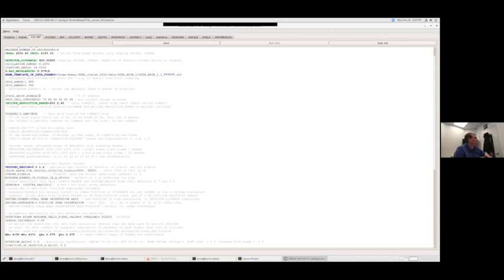You can also come in here and change the space group number and the unit cell constants if you want to. If XDS is picking the correct one, it's perfectly fine to just leave it as 0 and it'll pick the space group and unit cell constants.